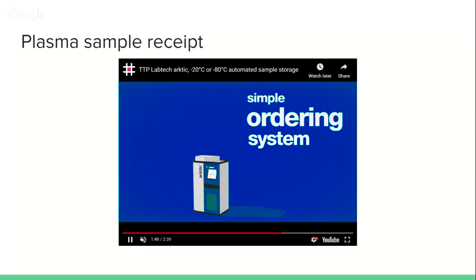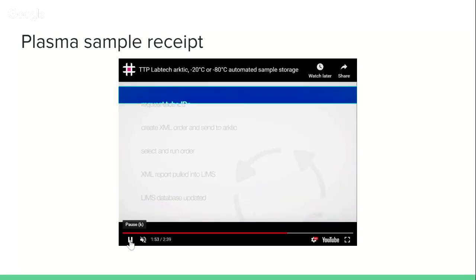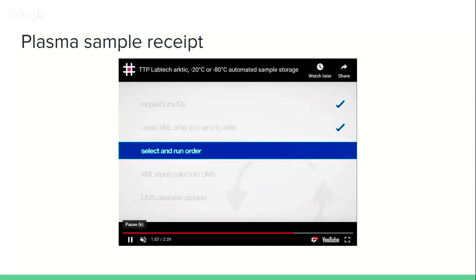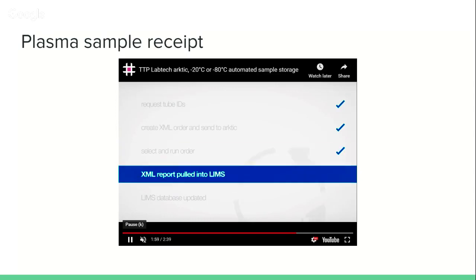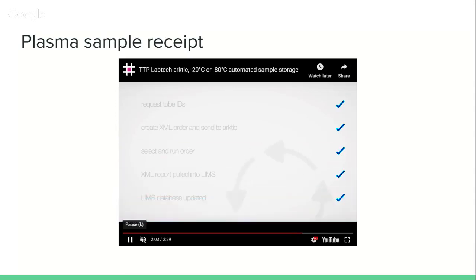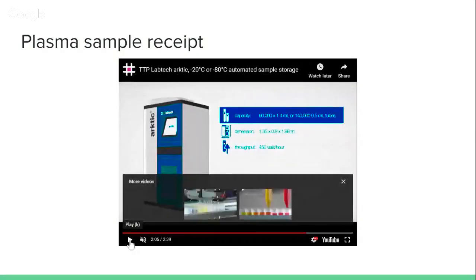If you want to do this manually, first of all, you'll have to have several freezers to store the same amount of tubes, and you're going to have to spend several hours, if not days of work, accessing the tubes manually one by one. So these types of machines are one way in which one can scale the building of a lab for diagnostics NGS.